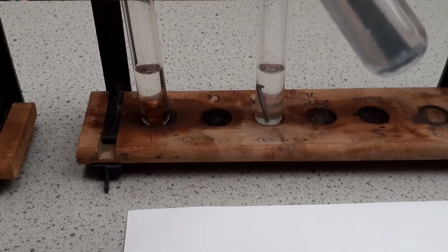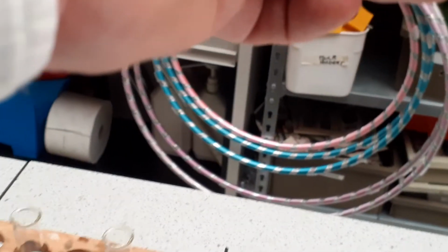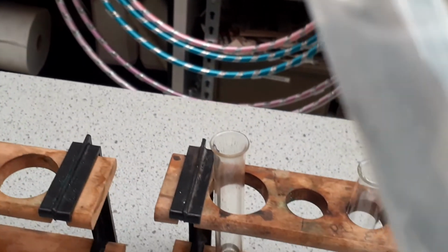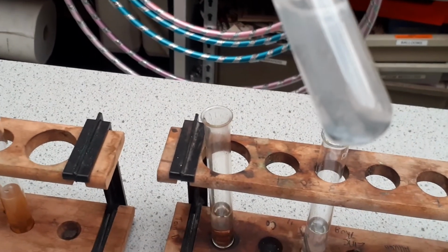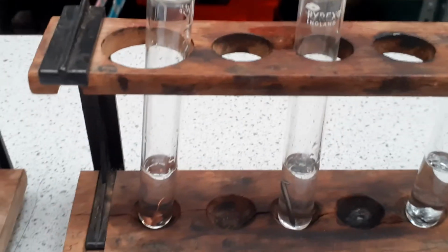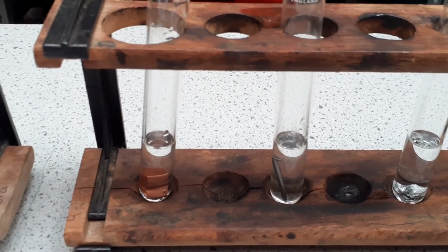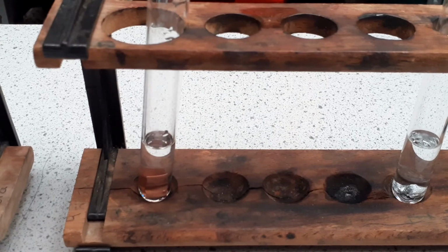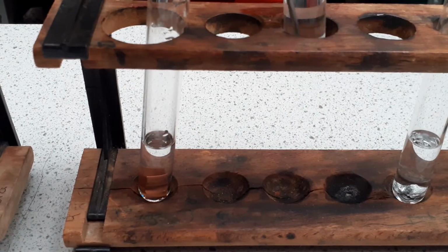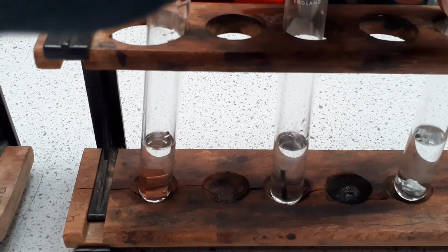Now if you look at the magnesium, there's some fizzing, and also on the base here we've got tiny bits of zinc being deposited, so there's a reaction occurring there. Now if we look at our magnesium sulfate solution, copper, absolutely no change. Iron, no change there. And zinc, absolutely no change there.